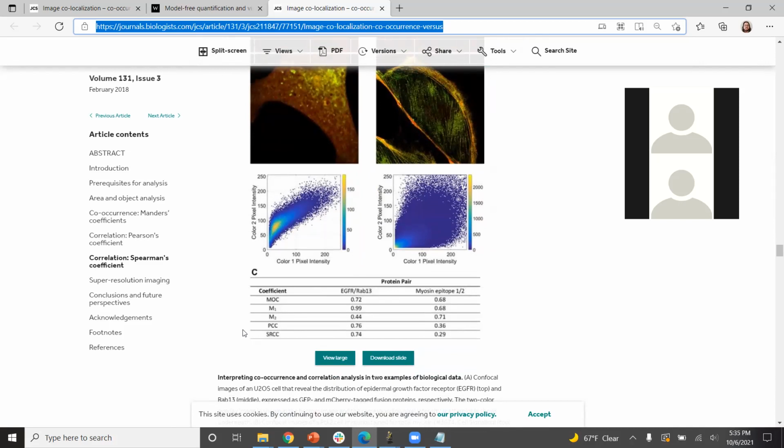And the first channel is MitoTracker Red, which labels all the mitochondria. So when you play with these images, it would be great if you can try what Stoyan showed to you, those two different comparisons, as well as the third comparison, which is drawing the ROI on the mitochondria, and then comparing that to see what kind of correlation coefficients you get out of that.